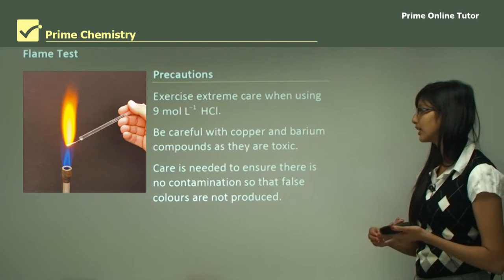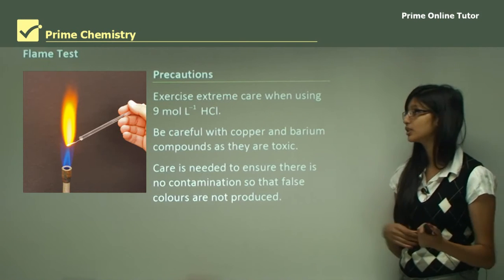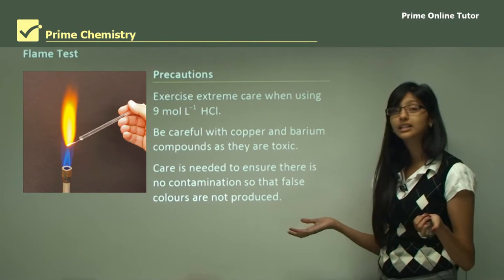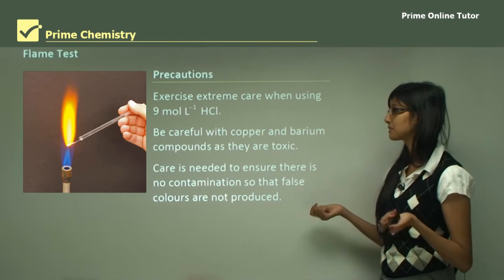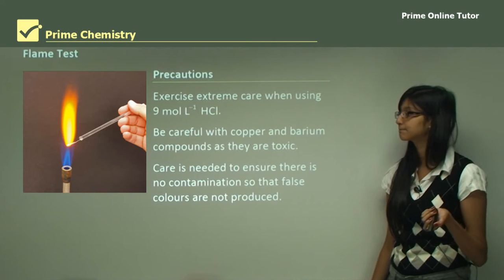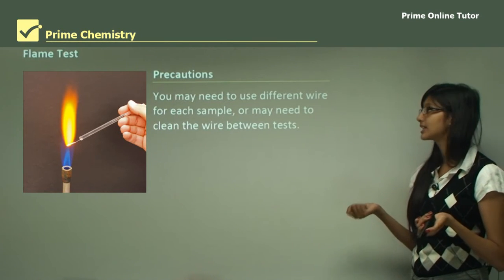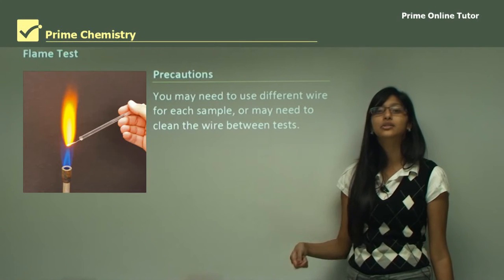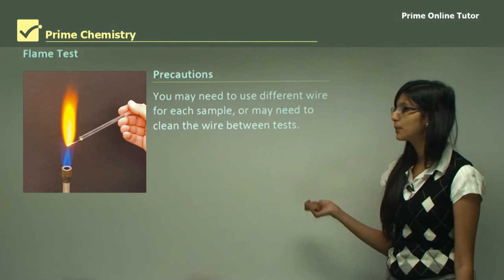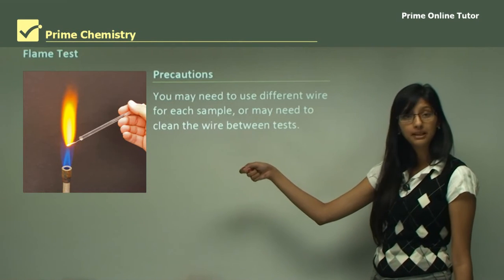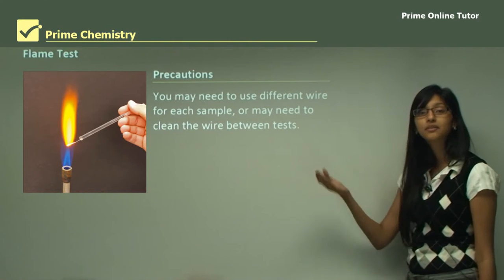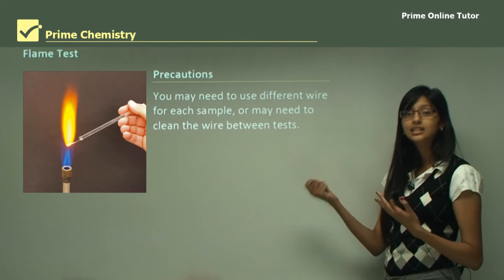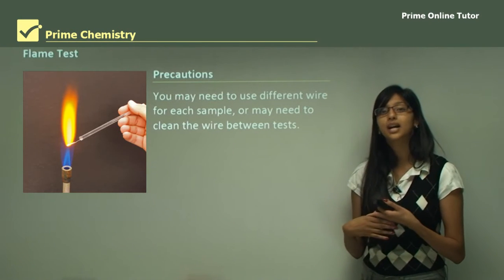Care should also be taken to avoid contamination, because you do not want wrong results — you want the cations to produce the correct flame color. If there is contamination, your sample might not produce the expected flame color. You may need to use a different wire for each sample, or clean your wire between tests using concentrated hydrochloric acid. Dip the wire in the acid and then place it in the flame to clean it before testing the next metal.